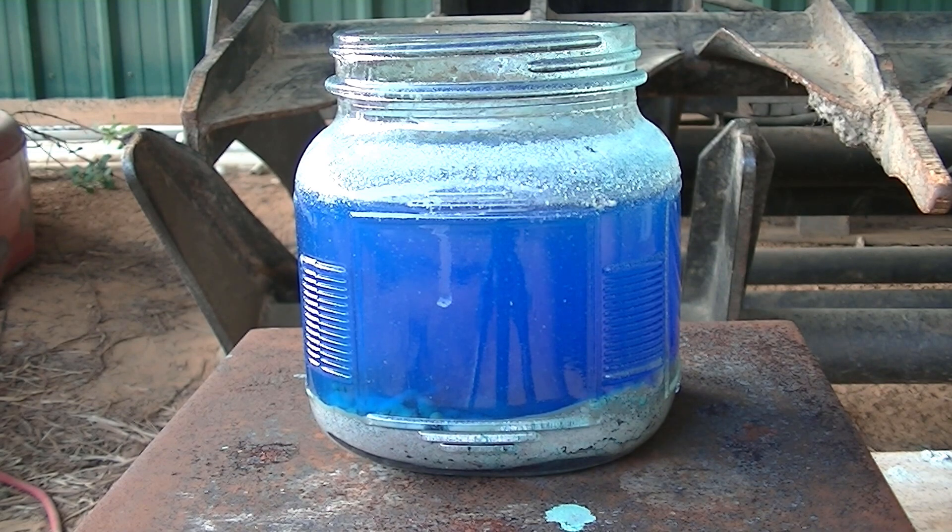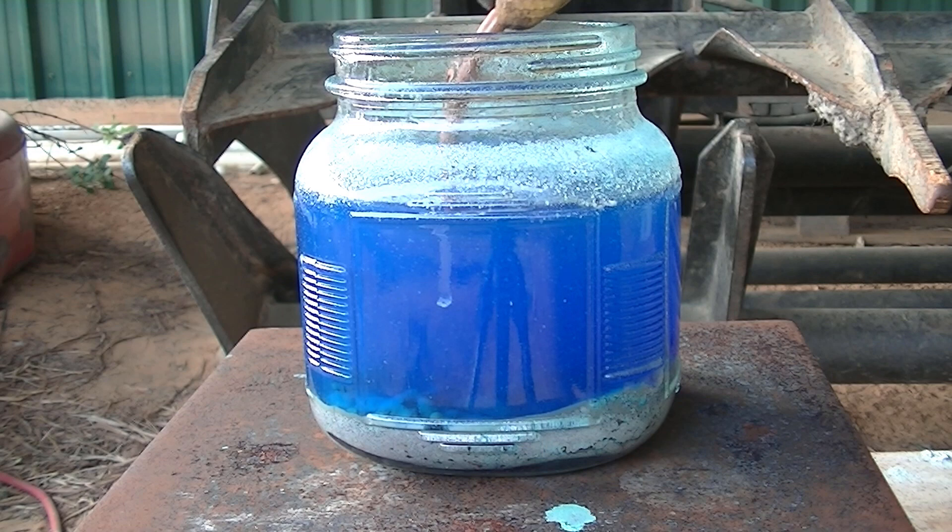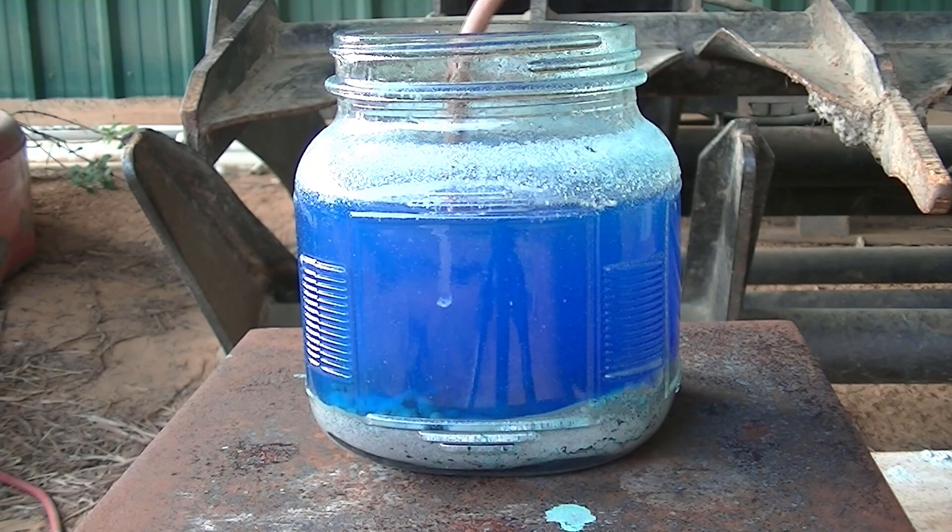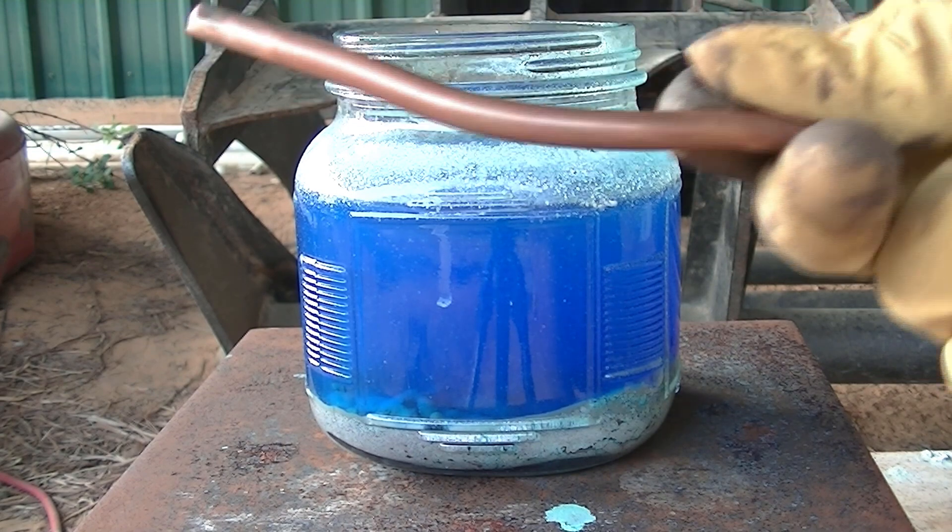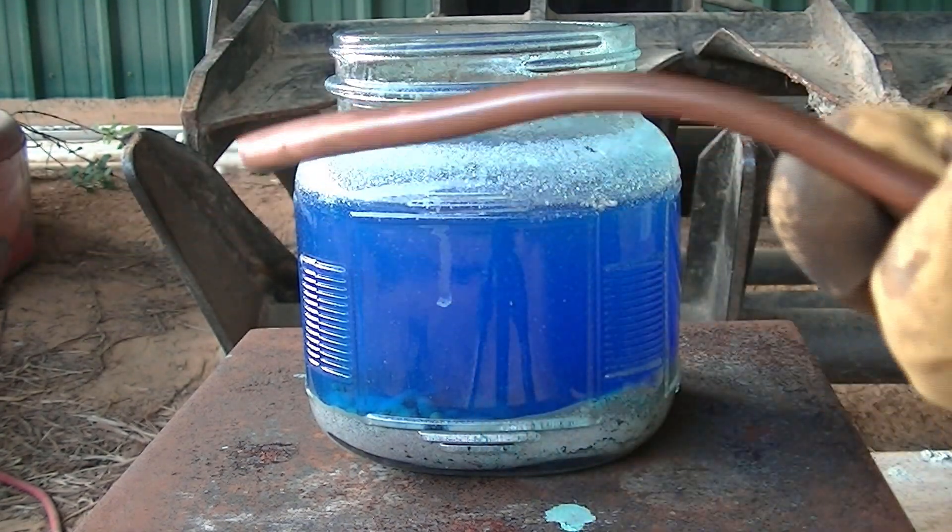You can see here the silver has precipitated out of solution. I'm going to demonstrate this by putting another copper tube in there and when I take it out, no silver will be on it. This is how we know that the reaction is done.